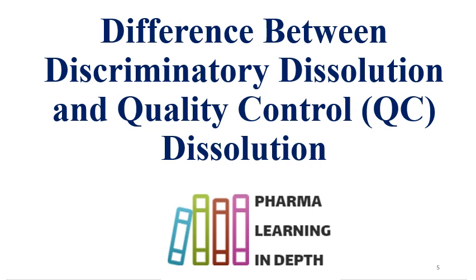You can make the discriminatory dissolution method a routine quality control testing also. Also, quality control dissolution method should have discriminatory power. But QC testing is used at plant level to release the batch into the market, while the discriminatory method is developed to have understanding about the formulation variations, and sometimes the discriminatory dissolution method can also be used as a quality control dissolution test.